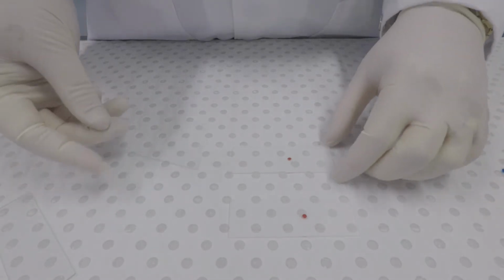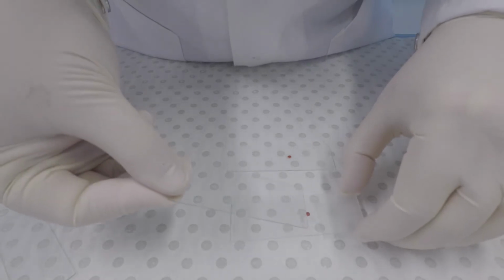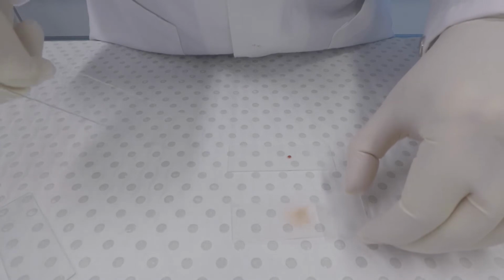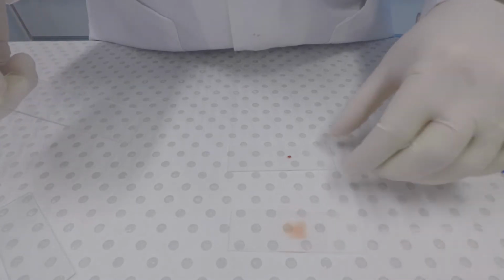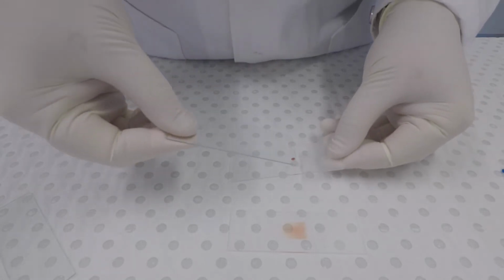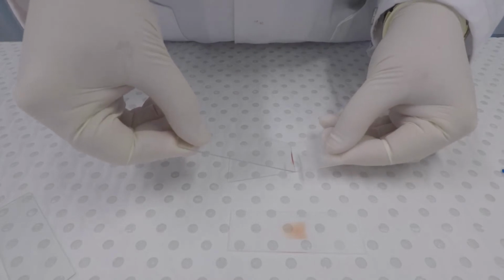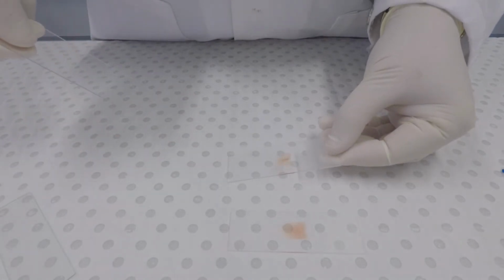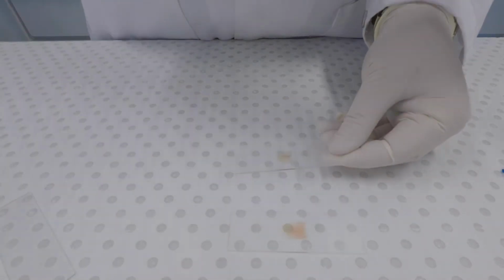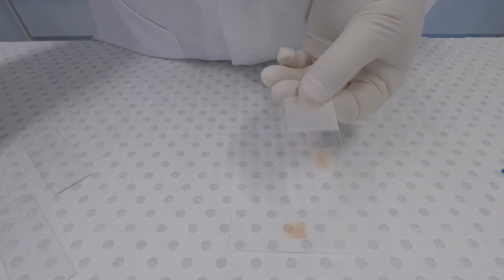We'll then take our spreader slide and place it in the drop of blood. And again, we'll use capillary action to move it along the edges of the spreader slide, and we'll draw down and separate out the blood smear. And one more time on the second one, we put the spreader in the drop, use capillary action to move the blood across and remove the spreader slide along the slide. And there we go. So we'll let the slides dry now prior to staining.